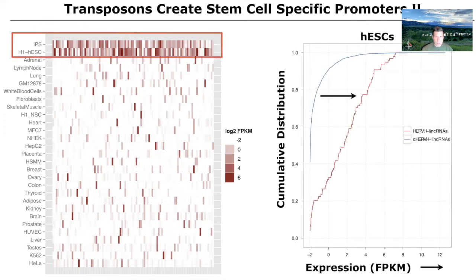So that's interesting. And now we can start to split these two into groups and get meta, if you will, or average them out. And one of the, it's not really a meta plot, but you could think of it kind of this way, is a cumulative distribution frequency. And we had a little exercise in the last video of deriving an empirical cumulative distribution function. But just to recap, what this is doing is saying, where does your data saturate to 1? At what point have we represented 100% of the data? And so here you're seeing 2 plots where the expression of the gene, so how much of the gene is being expressed, and between 2 different groups.